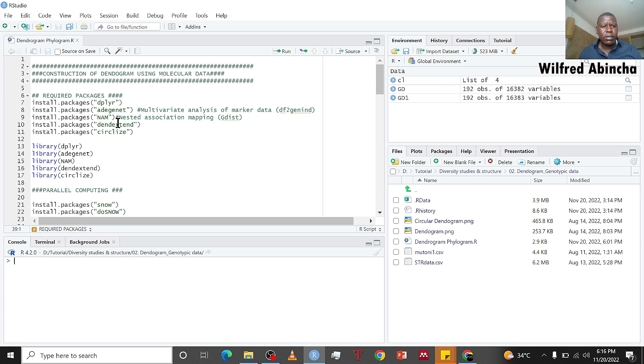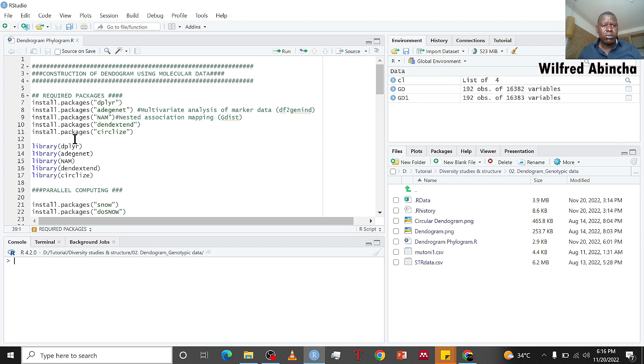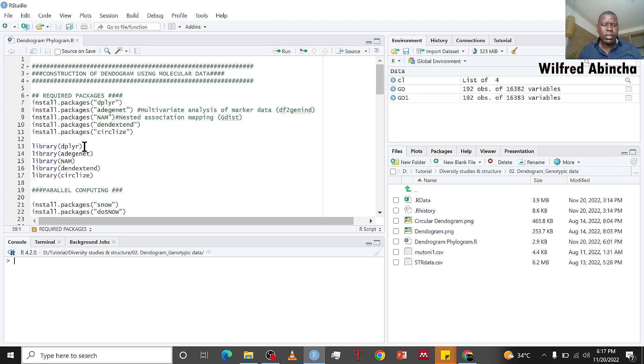If you haven't installed them, use the install.packages function to do installation. But if you have already installed them, let's use the library function and load them to the library.